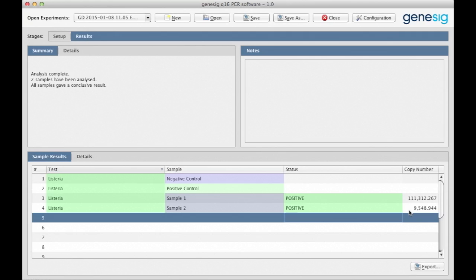The software uses information from the positive control, the negative controls, and the internal extraction control, as well as detecting the presence or absence of the target. This complicated analysis is completely automated for you on the Q16.